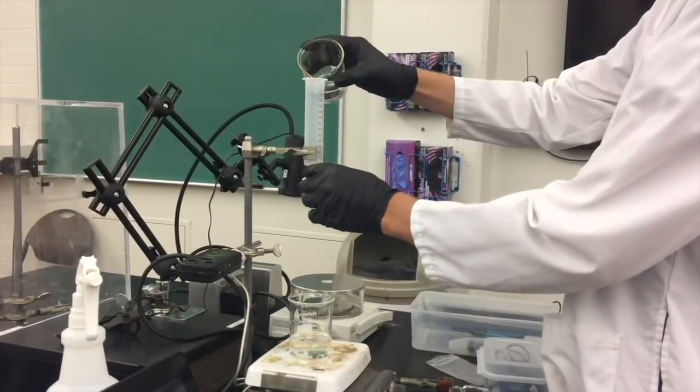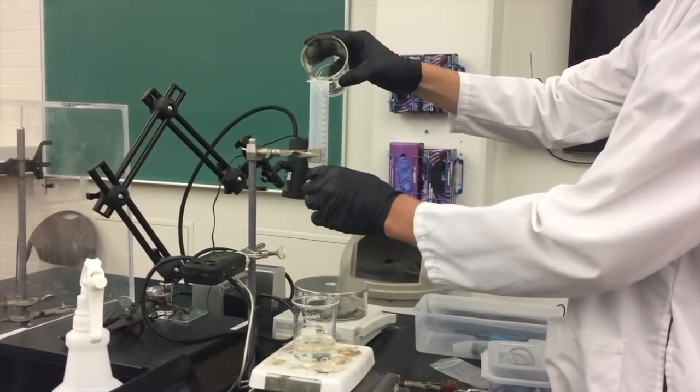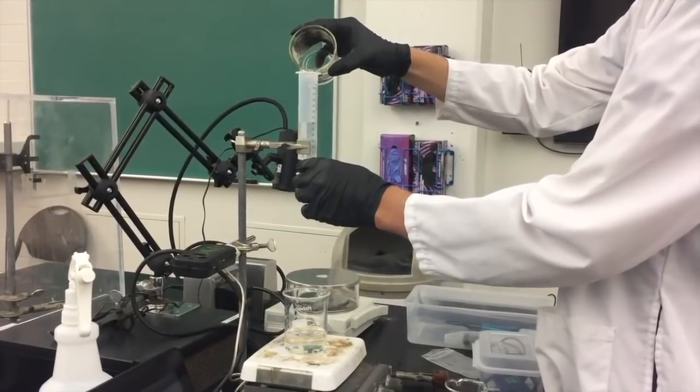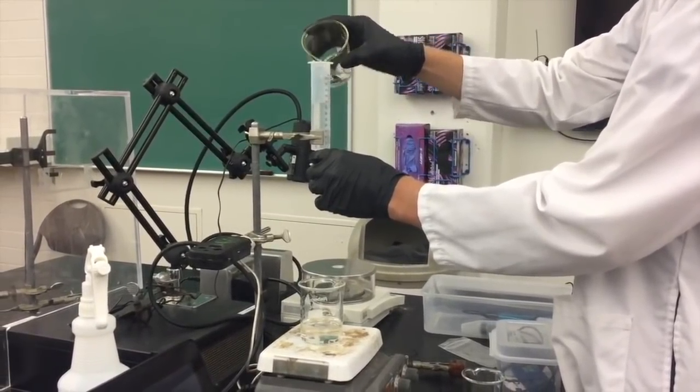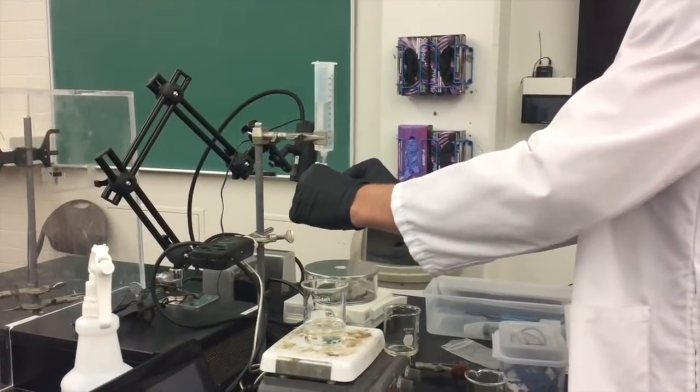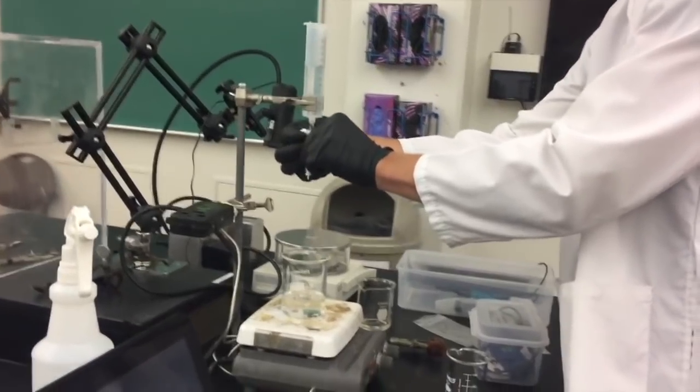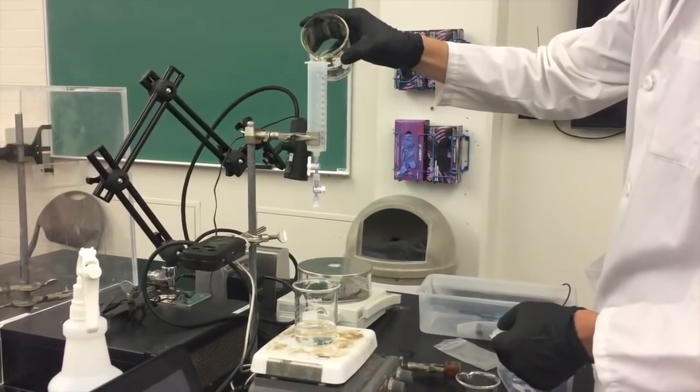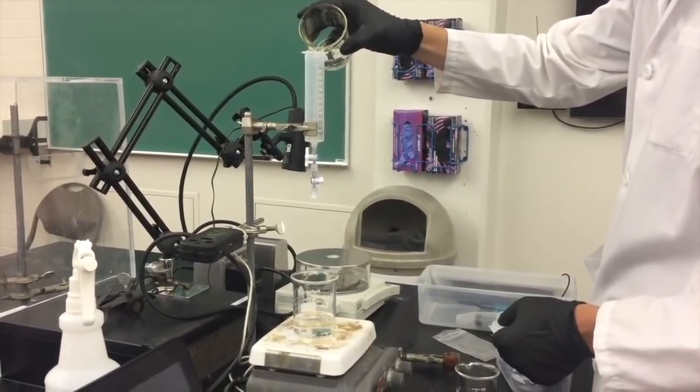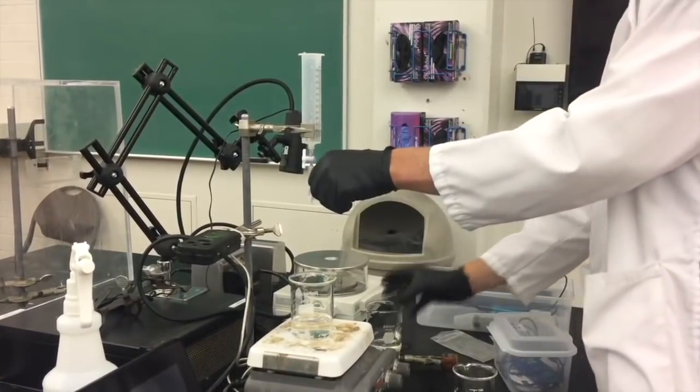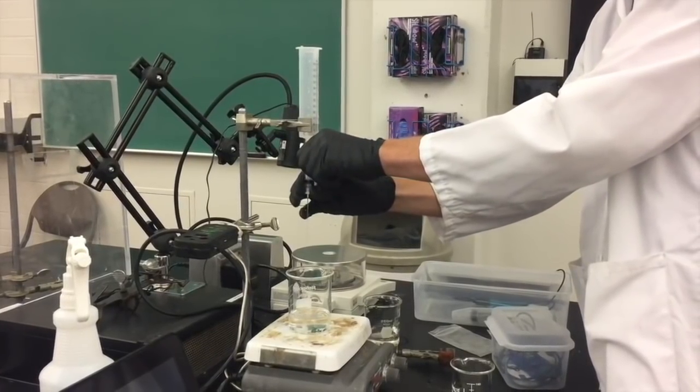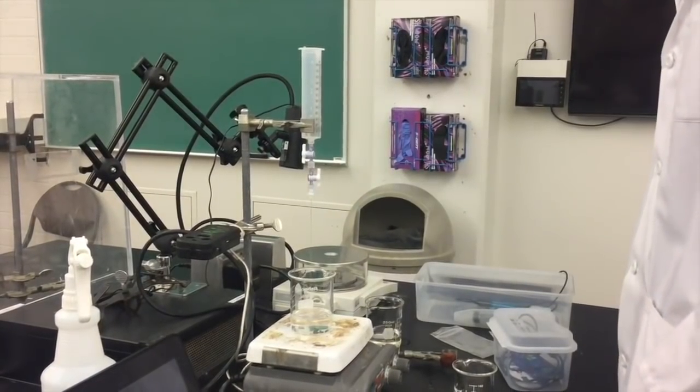We'll then place a beaker underneath the dispenser and open both stop cocks allowing the water that you added in to drain out. Once the water is drained you'll need to add about 10 milliliters of NaOH three separate times making sure that you coat the walls of the syringe as it's dripping out. This will push any remaining water out that would dilute your NaOH once you're ready to start your titration.